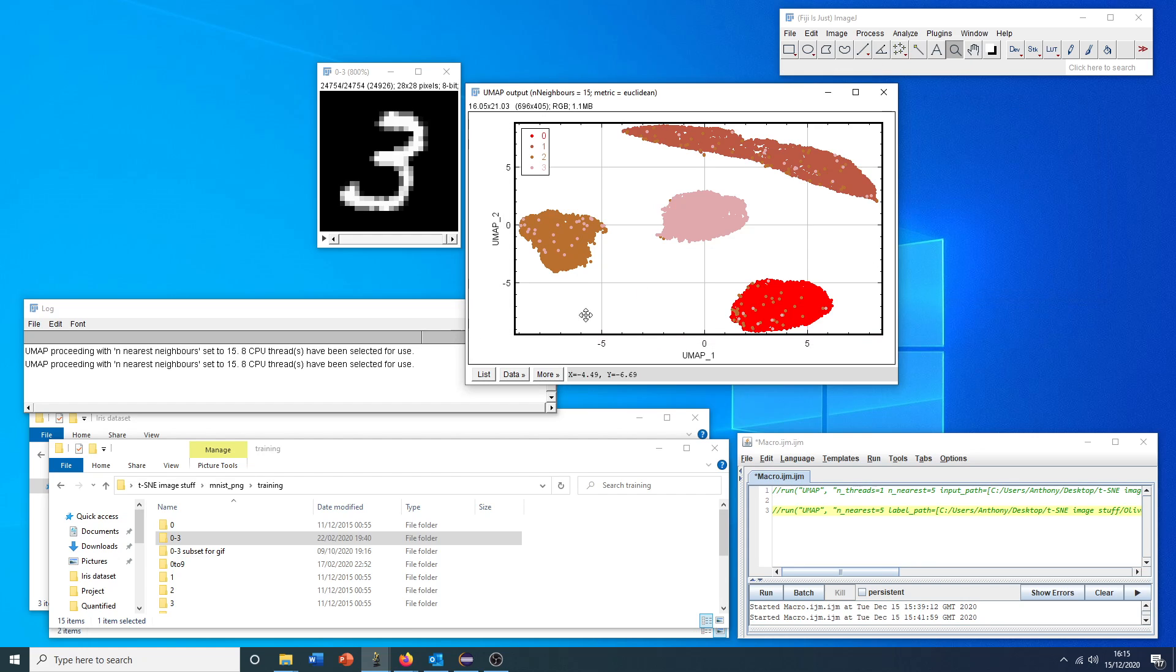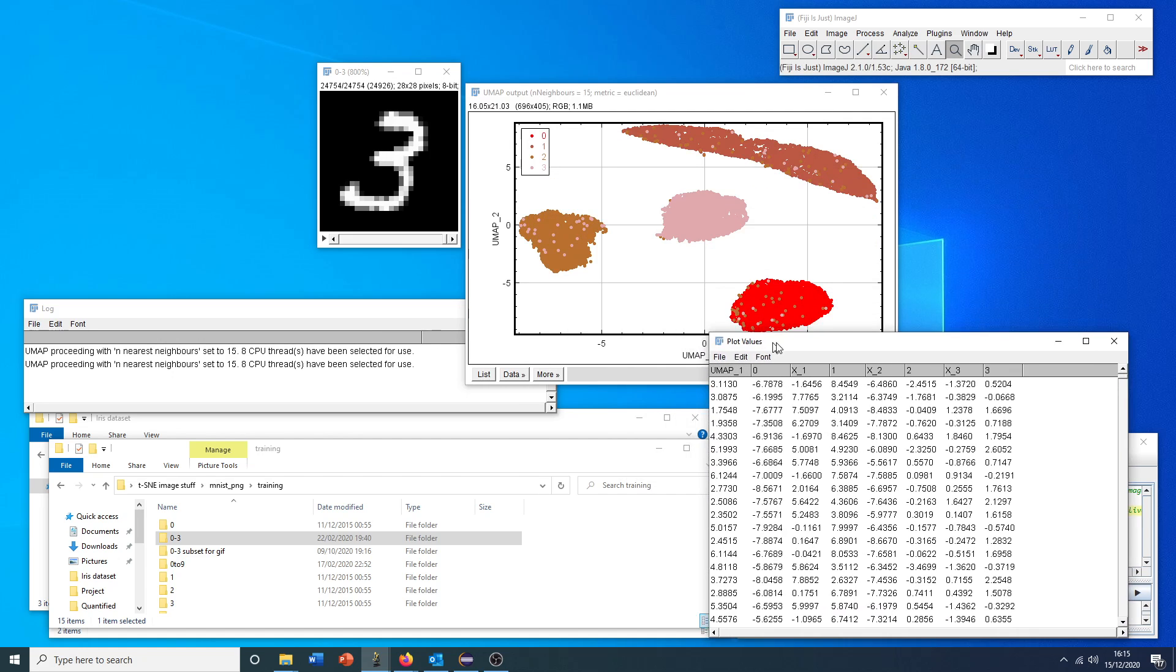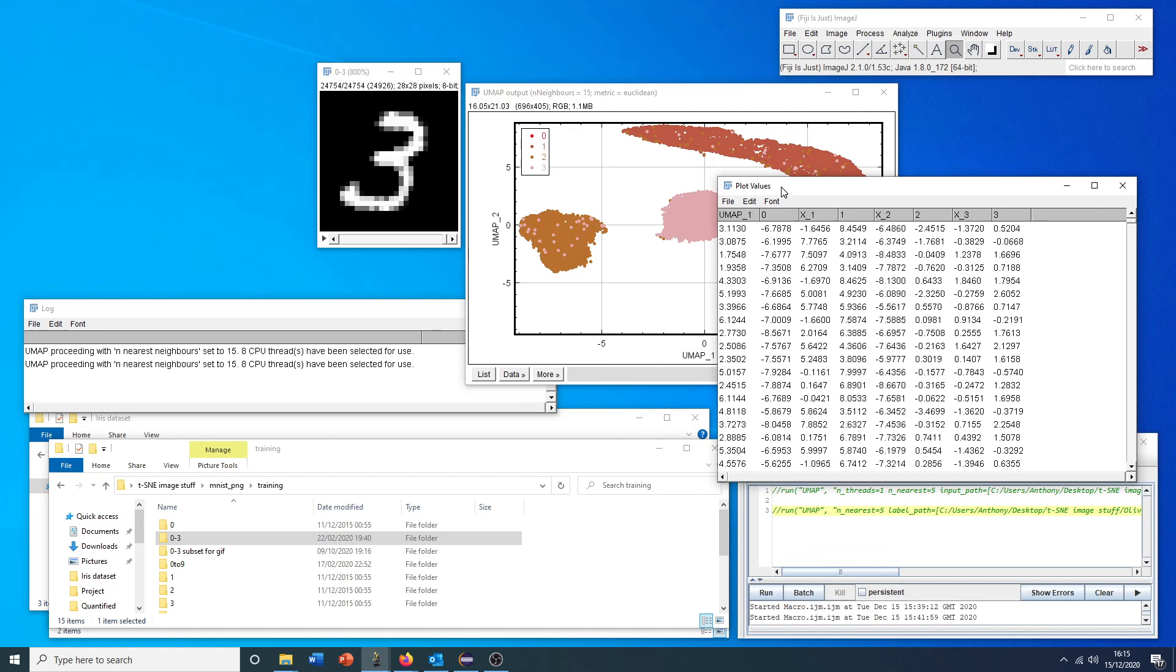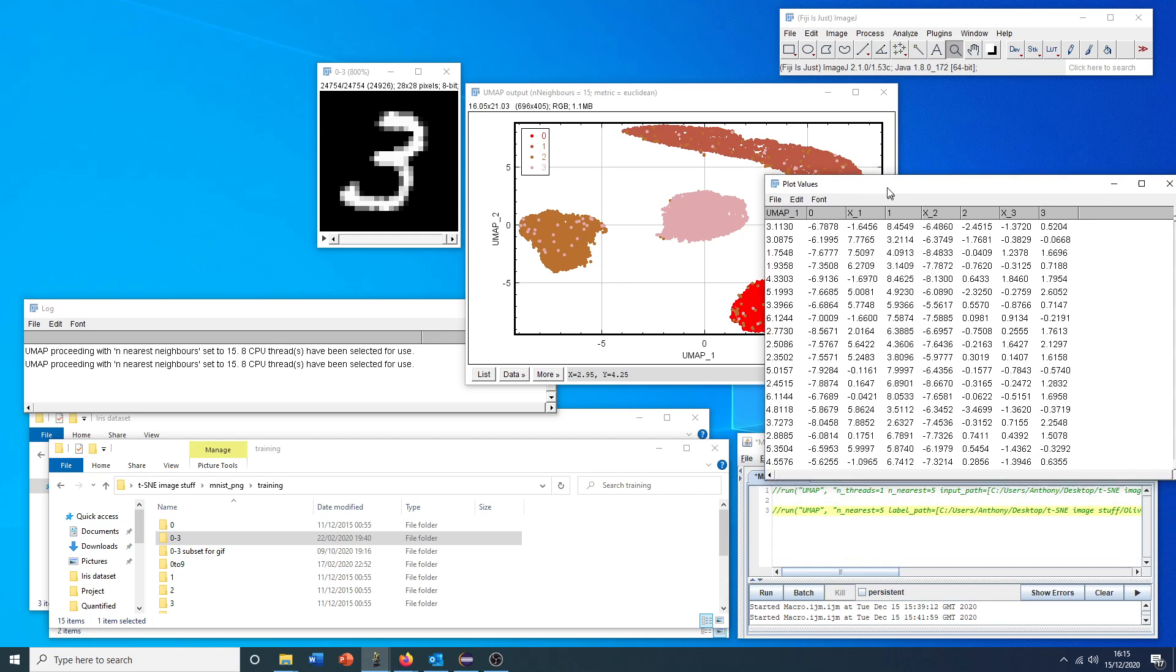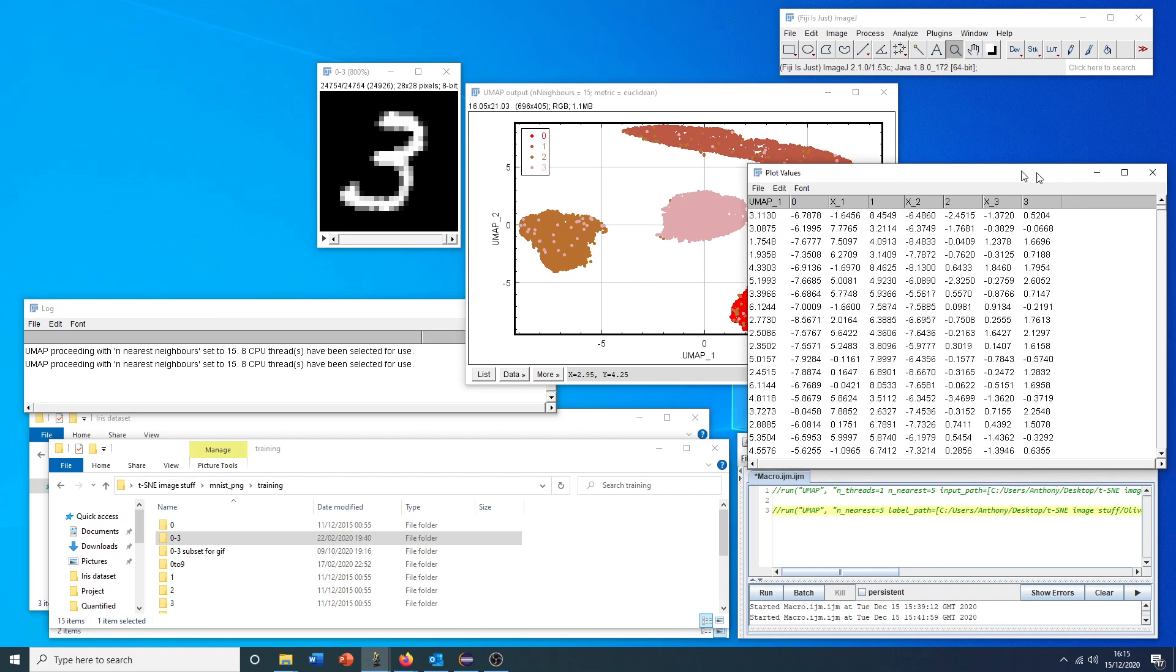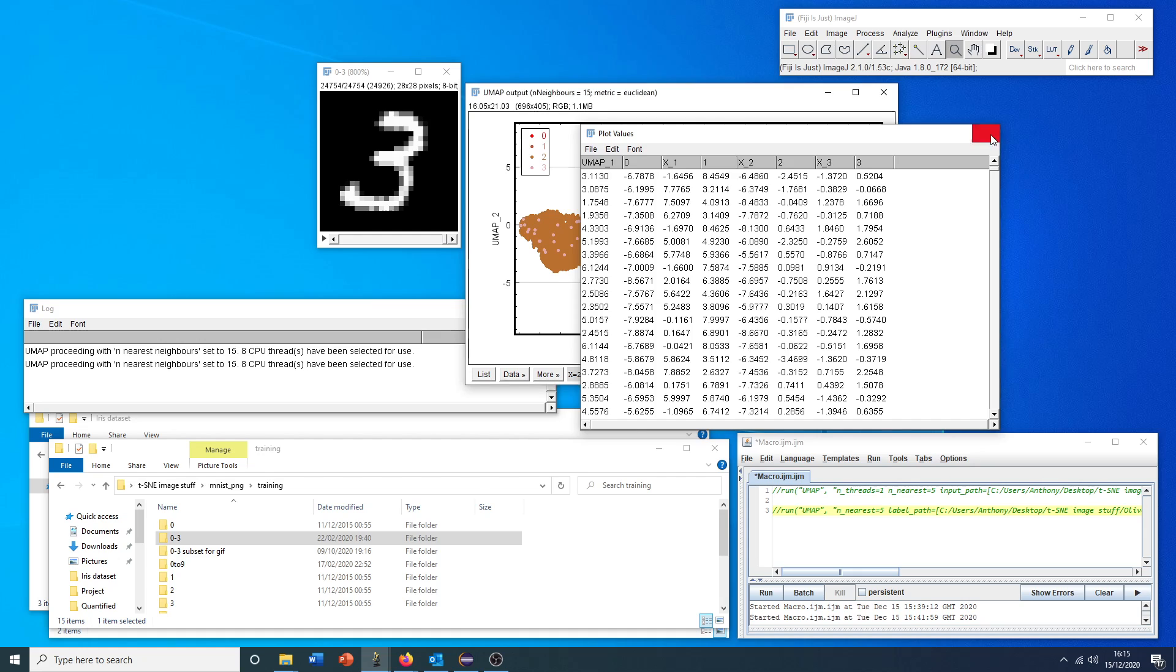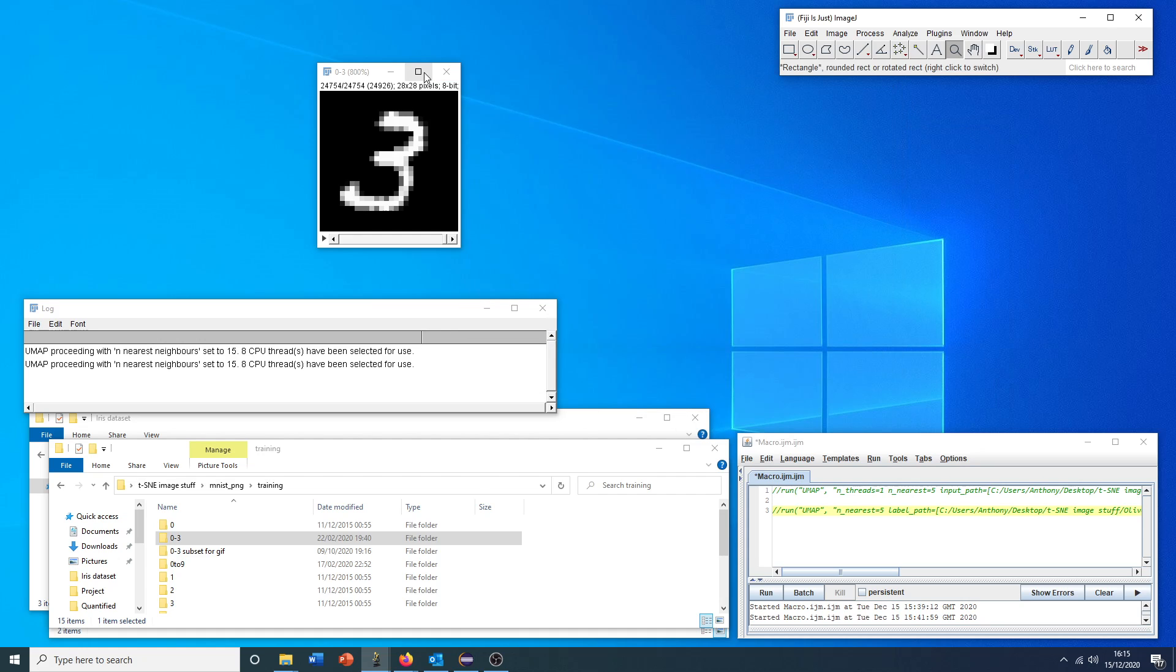Something else to note here that if we click list again, a feature of ImageJ rather than the plugin, we get all of these values presented in separate columns. This is nice because this is a representation of the ground truth clustering.